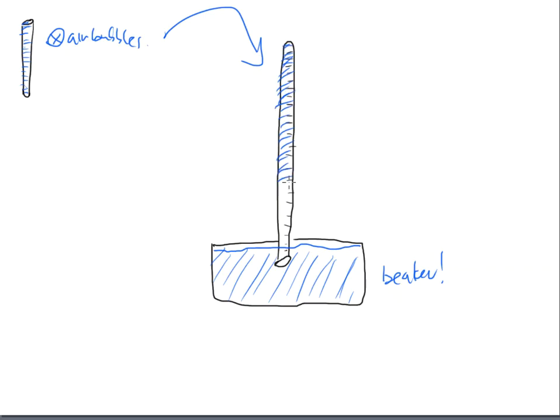And this is where I do not want air bubbles, right? I want this completely full of water all the way to the top. That way, when I start capturing these gases, the gases can go up to the top of this eudiometer, the gases take up space, and the gases can start pushing that water out as needed in order to take up that space that it needs to.